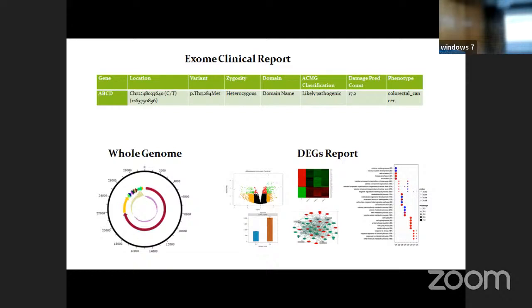It is your work to spend time interpreting the results, to go back to the bioinformatician saying that out of the 100 pathways you have given, I believe these 10 pathways, based on my scientific logic and literature analysis, are more relevant. Then again, the bioinformatician can generate a picture within 5 minutes or 1 day for you, showing these are the 10 pathways. Then he can do more in-depth analysis. But the role of the biologist is quite important here. Please remember, the role of the clinician is quite important. For interpretation, you have to apply your skill.